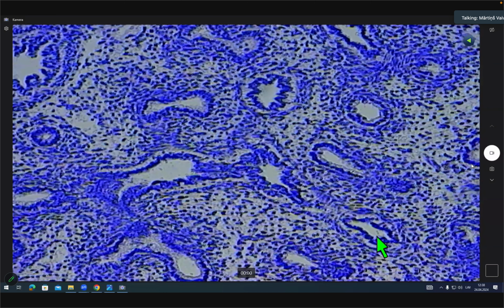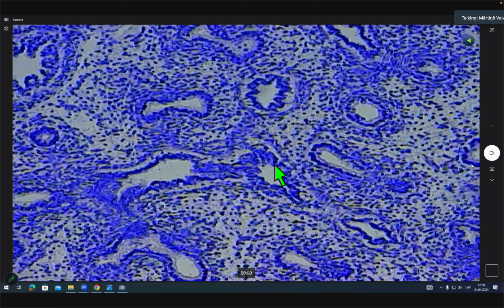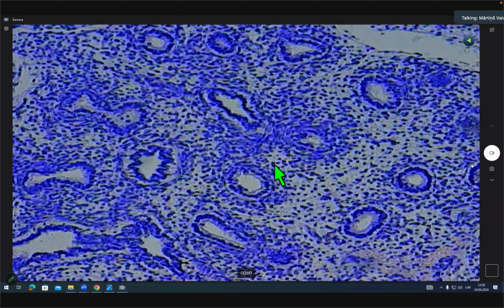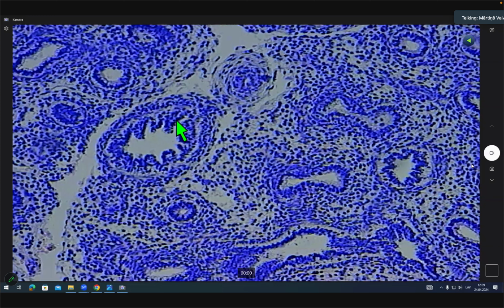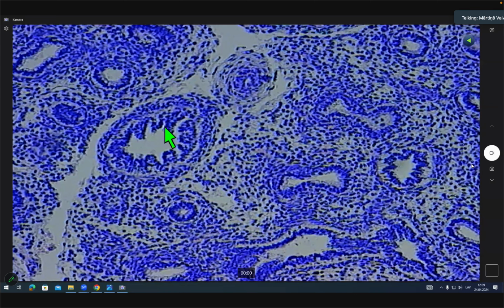Maybe this is a very small bronchus due to the thick epithelium, but sometimes in slides you won't see bronchus at all, so be careful. I'm showing this variation so you can be ready for the colloquium. Maybe this one, you see it's much bigger than all the other openings. Epithelium's a bit thickened. There's even muscle tissue appearing here, but this looks more like a developing bronchus. Typically, the lumen is wavy, so wavy-looking lumen, a wavy contour.